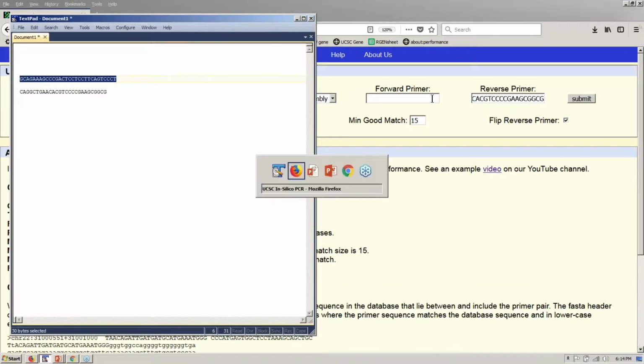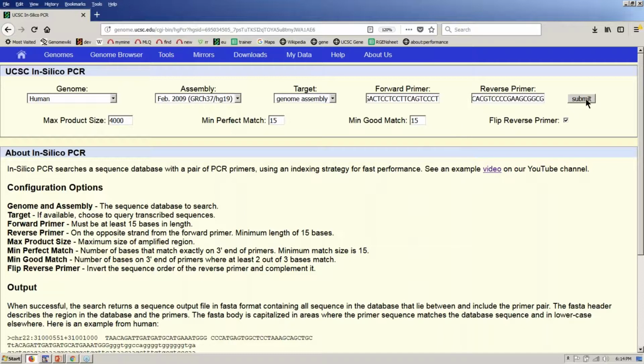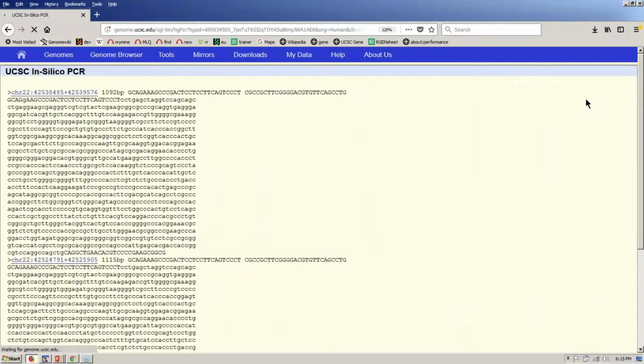And then grab that one and paste it. So I know I'm going a little bit fast, but the video will be available and you'll be able to do it. And in fact, this is very similar to an example that we have preserved in one of our videos on our YouTube channel, so you can find that.